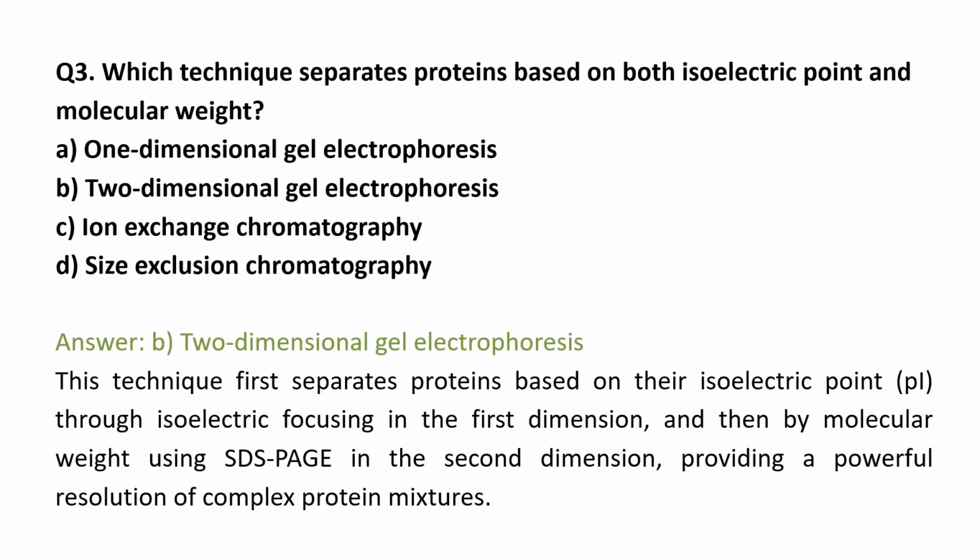The technique first separates proteins based on their isoelectric point through isoelectric focusing in the first dimension, and then by molecular weight using SDS-PAGE in the second dimension. So two-dimensional gel electrophoresis provides a powerful resolution of complex protein mixtures. So that's two-dimensional gel electrophoresis.